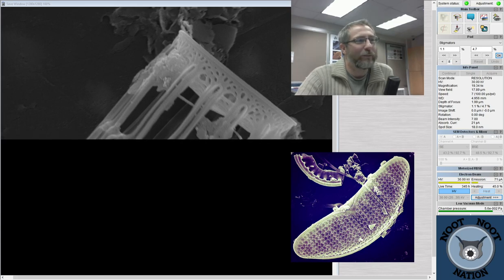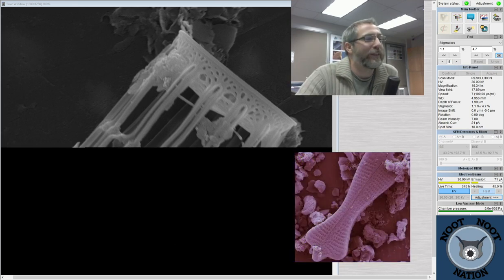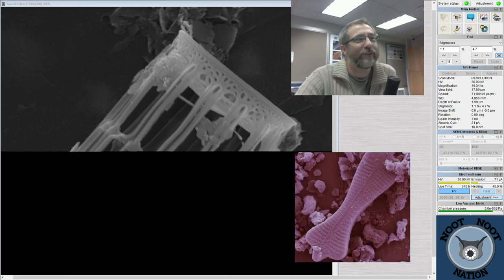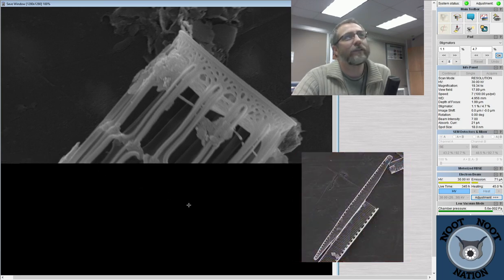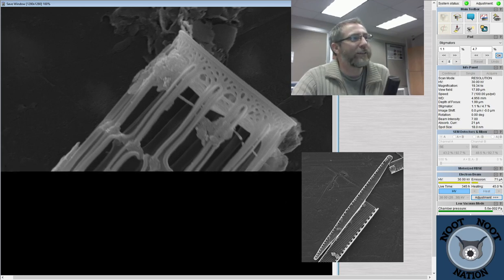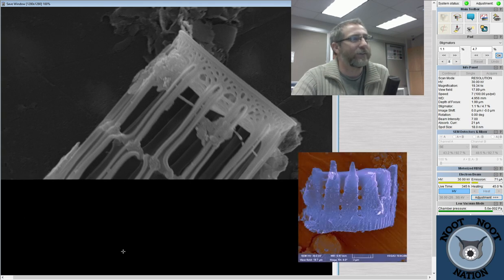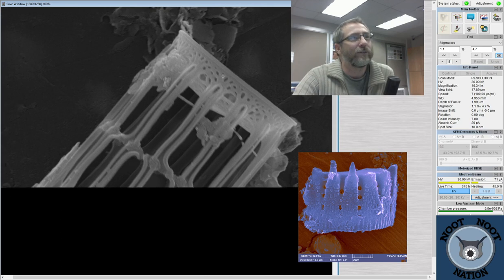Are these the green bracelet? I don't know in my picture what color I made them. You know, those colors are all just fabricated, so hard for me to say. I feel like the focus is still a little fuzzy on this one. I'm unhappy with the focus, because I was trying to get this thing in focus, but it looks like it actually put stuff on the outside edge of it a little out of focus. But you can see how intricate the structures are in here, right?